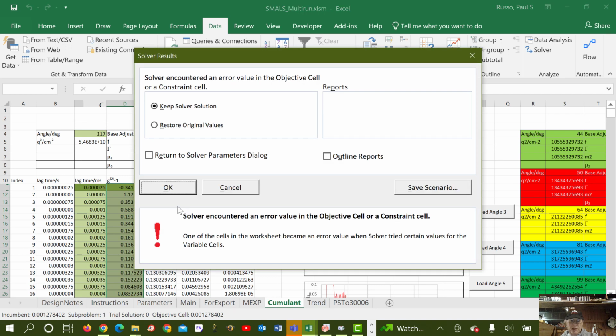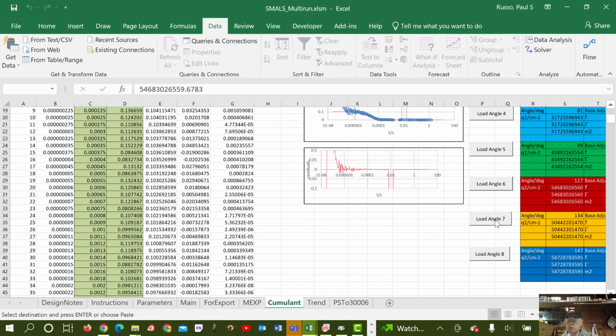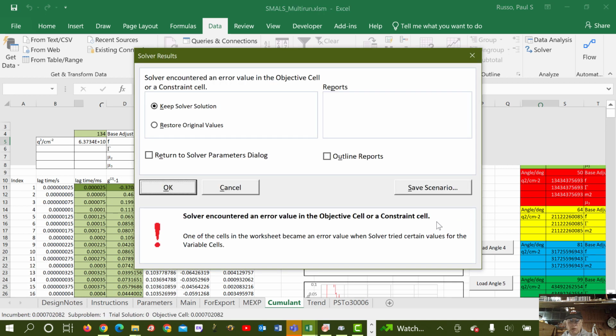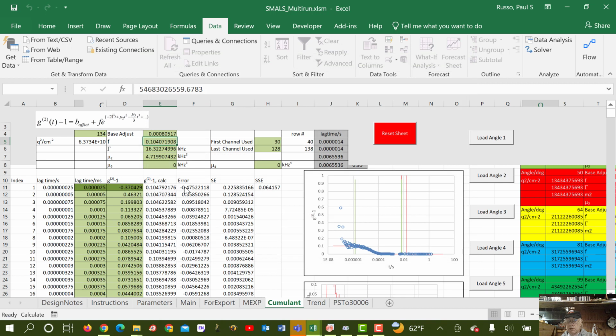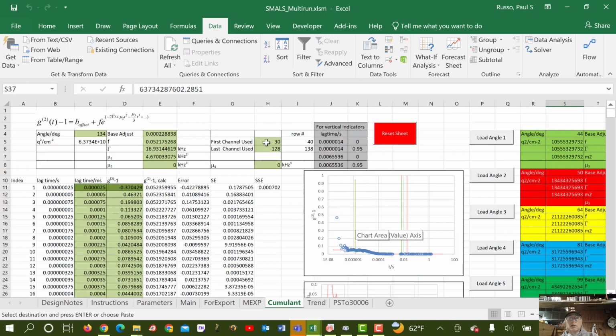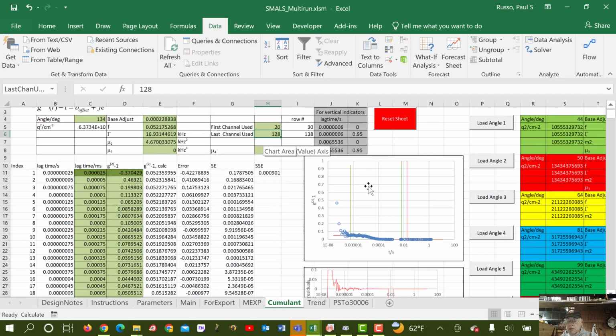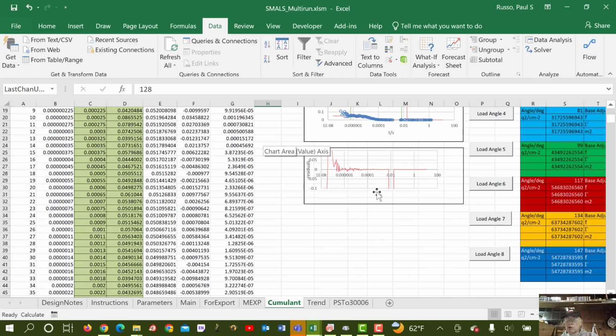It's not the quietest data. This would be a sample that if we were doing this in a real serious scientific study, we would really get multiple runs and build quieter data. What do I think about that? Do we want to move that back? Let's move it back to 20 at this point. Take a larger range. Which one was that?